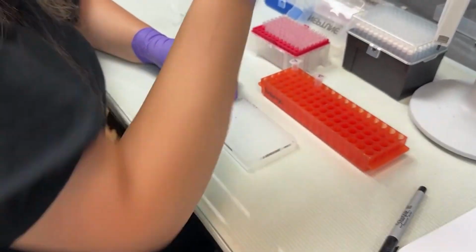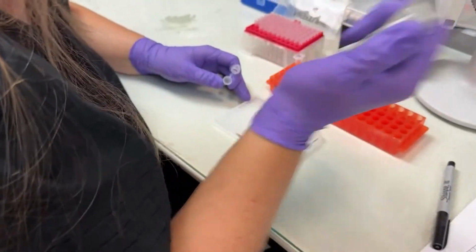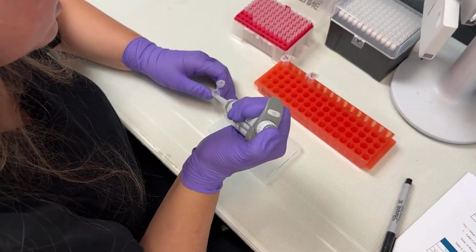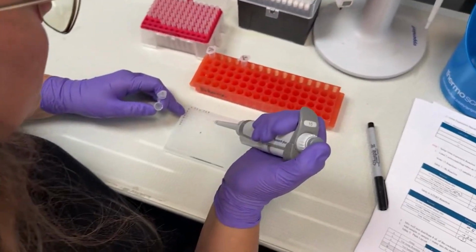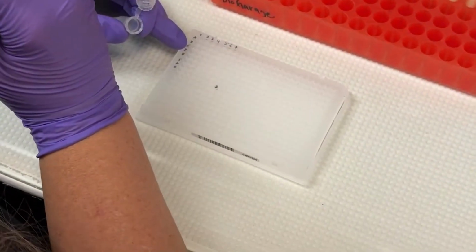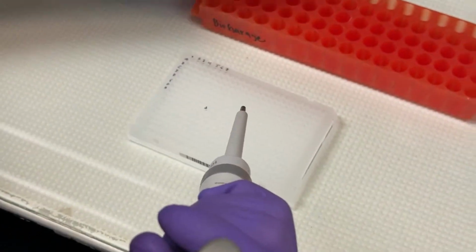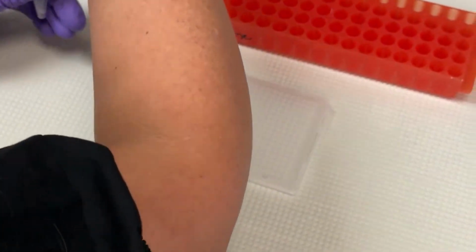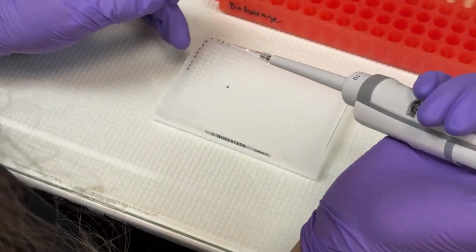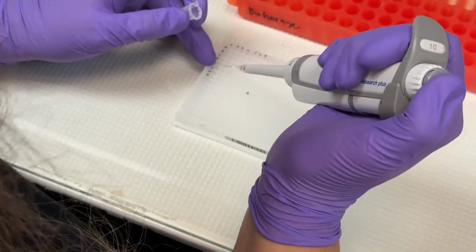Some other useful techniques are to coordinate the tips you're using to correspond to the plate format. That way you know if I used that tip, I completed the sample addition. So that was C, D, E, 1.